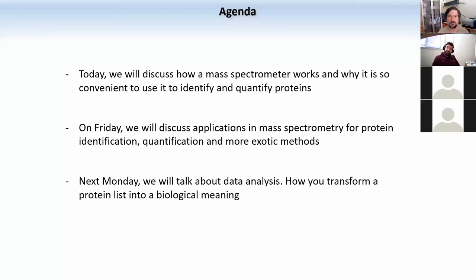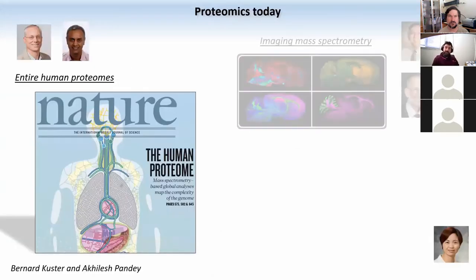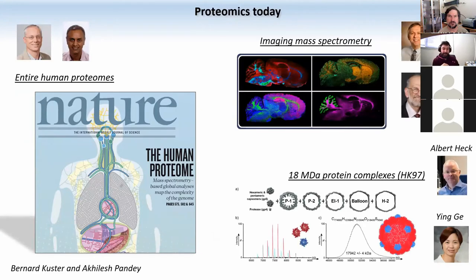Anyway, enough with introduction. I'm going to give you a brief panorama of where we are with proteomics, and then we're going to talk a little bit about how we do all of these things. First of all, proteomics today is a very widespread technique, and we have reached very sensitive and very comprehensive levels of proteome characterization.